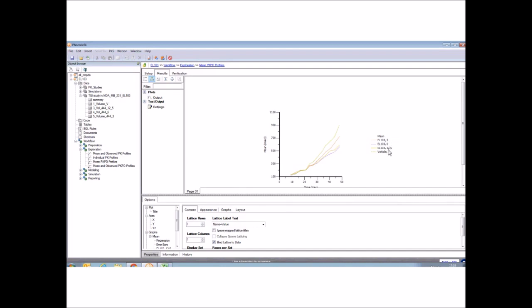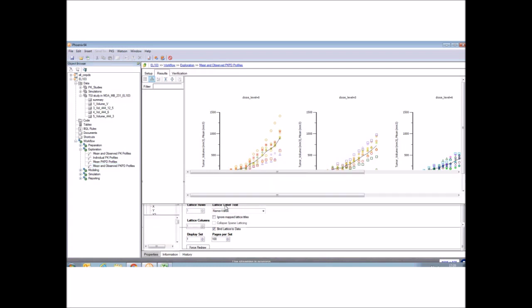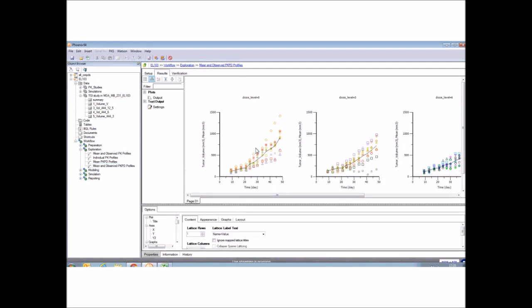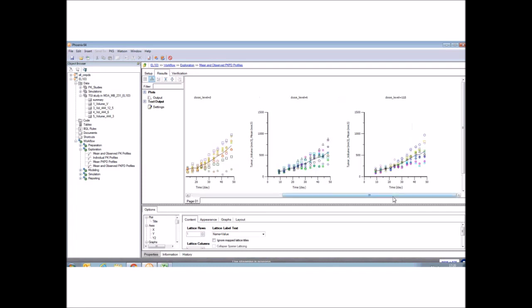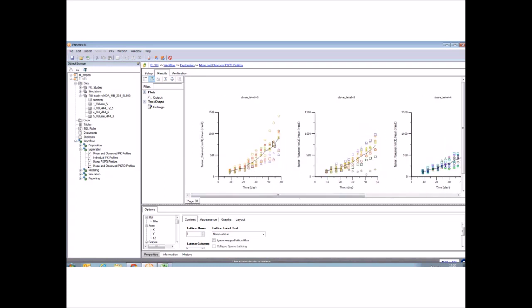Here you've got all the 4 curves for the compounds at the 3 dose levels, plus in green the control, the vehicle. And again, here some more details where you got the mean profile together with the detailed tumor volume measurements for the 10 animals per dose level for all these 4 groups. Okay, so this looks good. So we are now ready to start into the modeling stage.